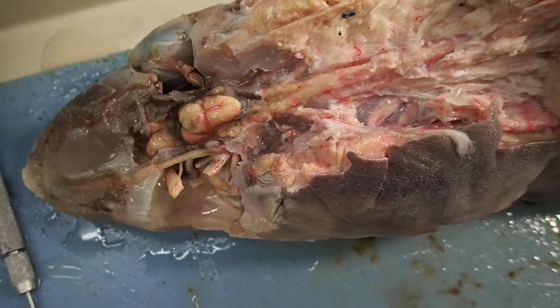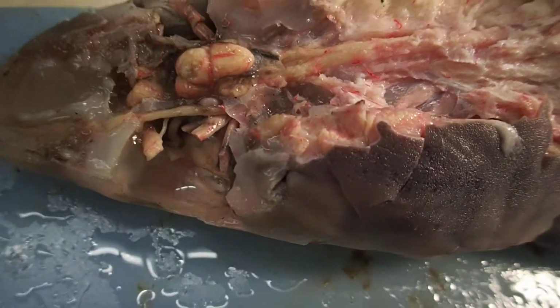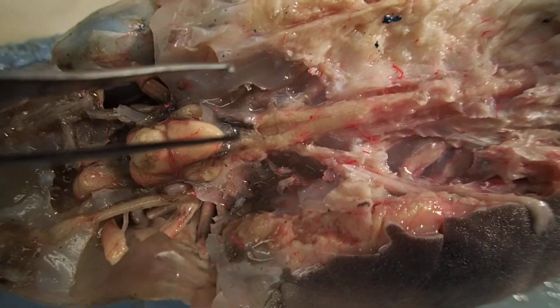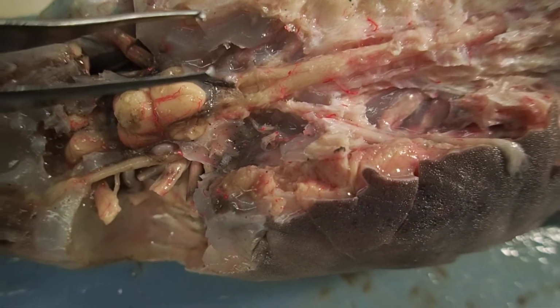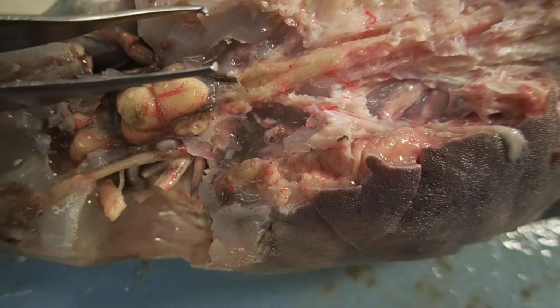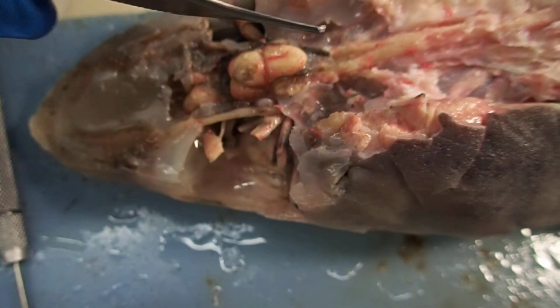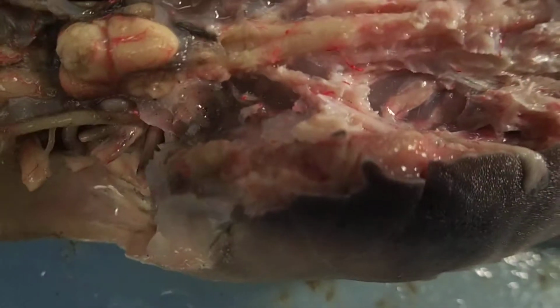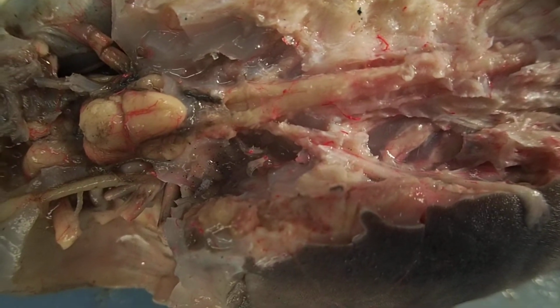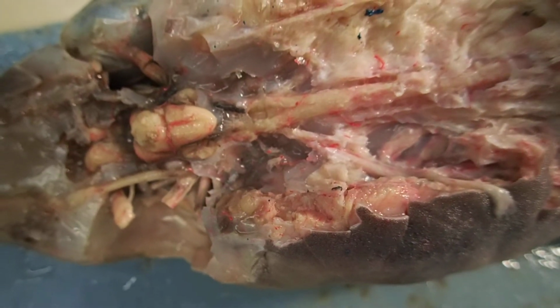All right. If we were to look at the two spiracles on both sides, directly in between the spiracles on the dorsal side of the shark, so the actual skin of the shark, you would see two other pores that are much bigger than these ampullae of Lorenzini. Plus, the ampullae of Lorenzini are down towards the rostrum. These two are endolymphatic pores. Right? Endolymphatic pores have endolymphatic canals connected to them, and that's going to be running deep.